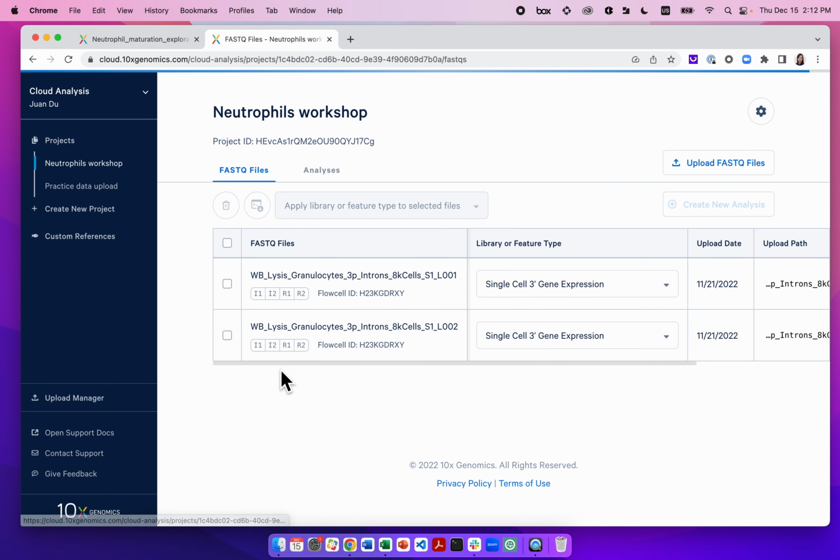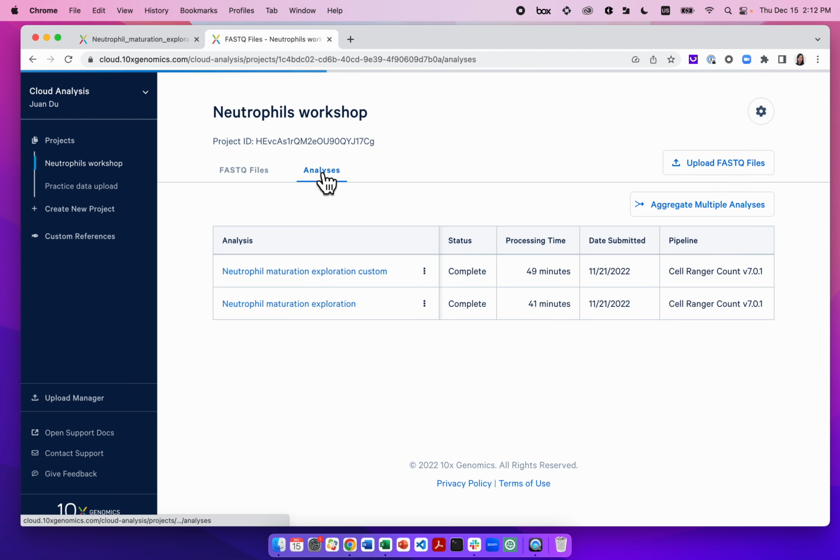We analyzed this dataset in two ways. We analyzed the dataset with default parameters, and also using a custom parameter, which is the force cell option. We will start assessing the results using the custom analysis result, and then carry out some comparisons at the end of this video.